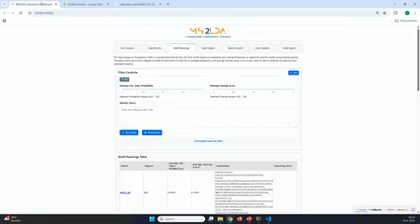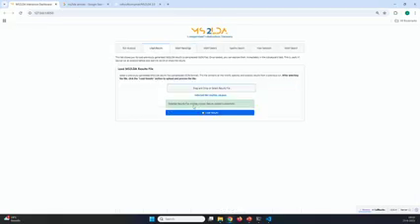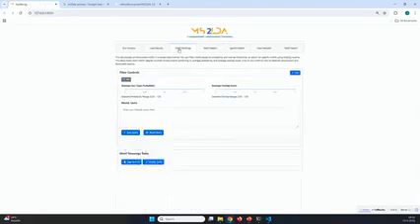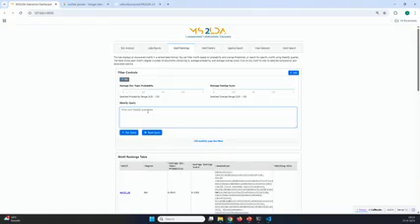So I have the dashboard running here. I think I loaded the file already, right? So that's done. I go to the motif rankings. Then we type in the query, for example, student data, MS2LDA.